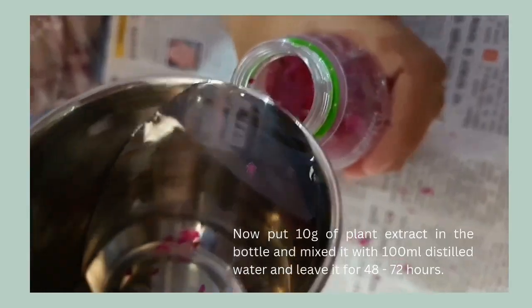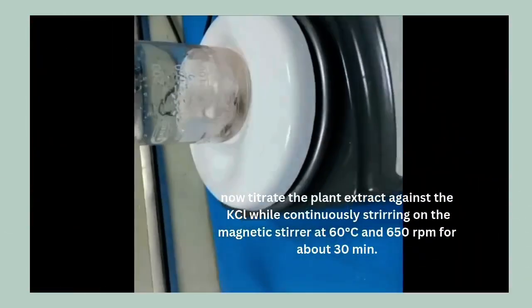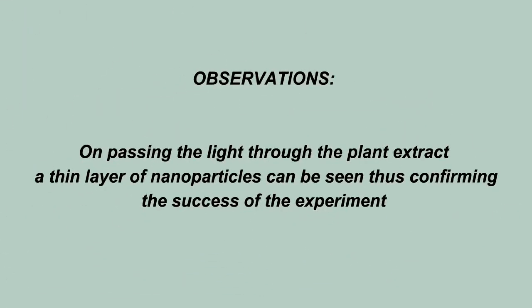650 rotations per minute. Now, add the KCl solution drop by drop from the burette while stirring. After 30 minutes, take the magnetic beads out and let the extract settle down before observation. When the sample was observed against light, a thin layer of nanoparticles was observed floating on the extract.